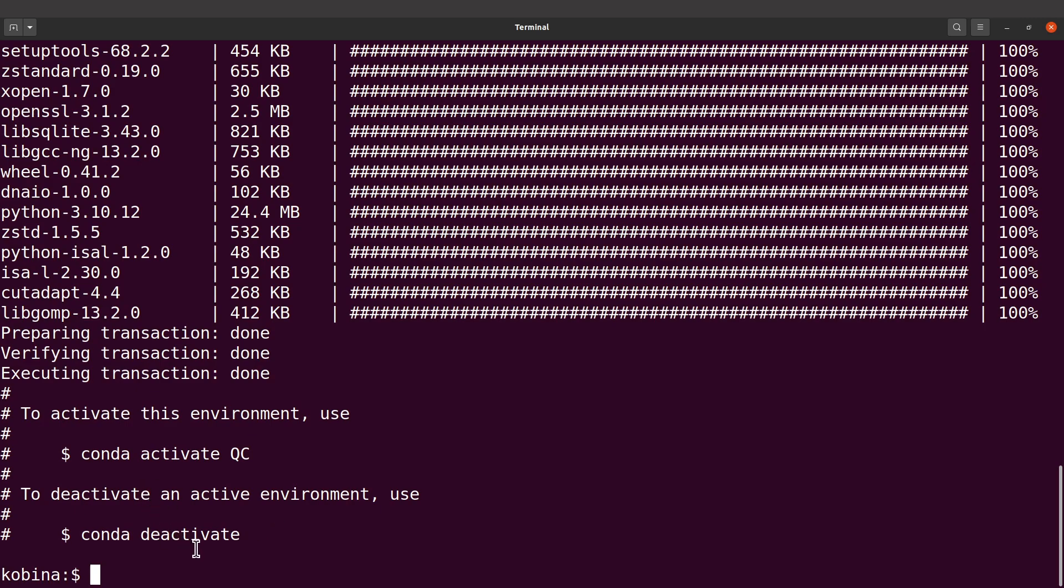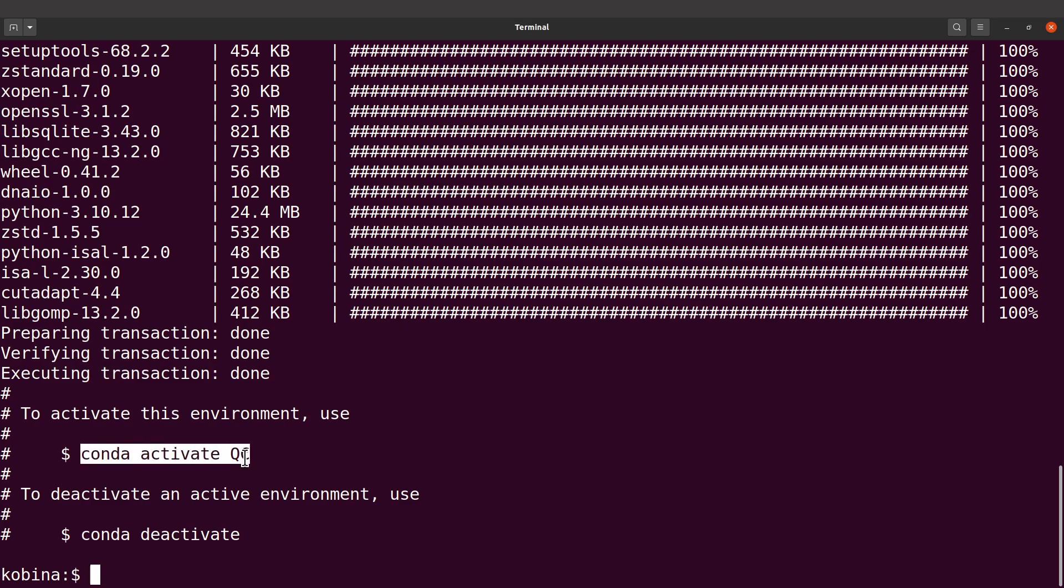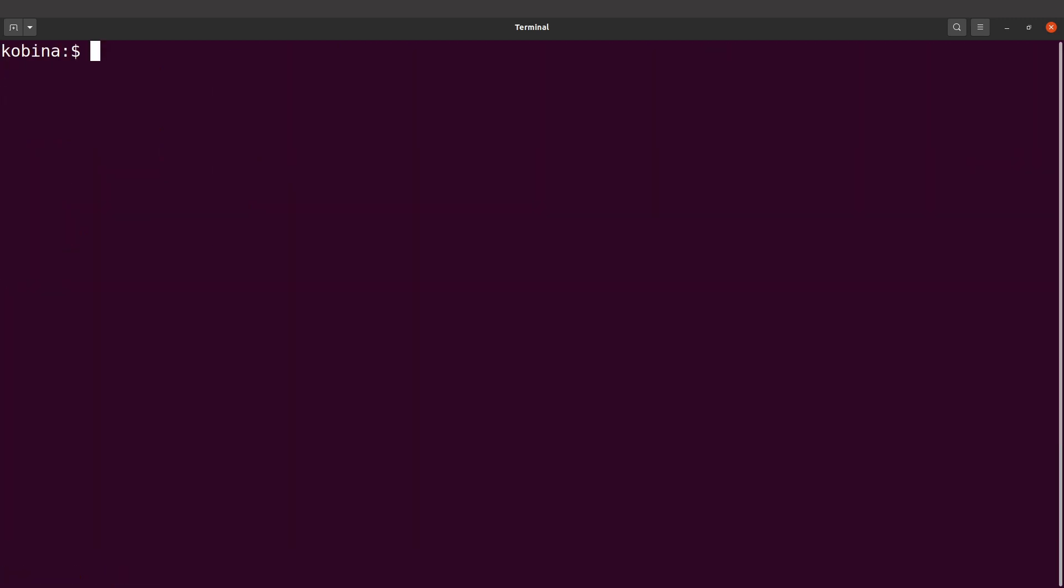If you want to use Cutadapt you need to first activate the environment. Let's clear the screen and then activate the environment. I'm going to say conda activate QC, the name of the environment I used. That has been done, so once it's done you can just test Cutadapt.